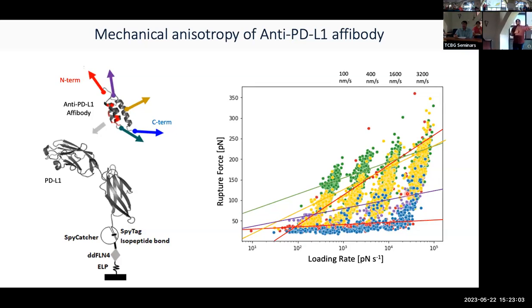And that was monitored using atomic force microscopy. So what you see in the colors are related, depending on the shear flow, or in the case of the AFM, the pulling rate of the AFM cantilever, you have different binding strengths. And we were curious about why this happens.